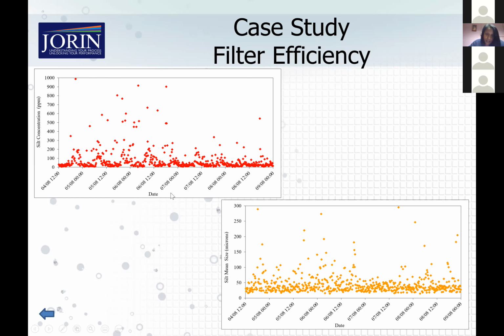So again, it just highlights once again the benefit of online monitoring, that you can actually see all of those differences. If you just took a few samples every once in a while, you'd never actually be able to see the effects of the process and how it changes over time, and all the external forces that can give you changes to the data as well.